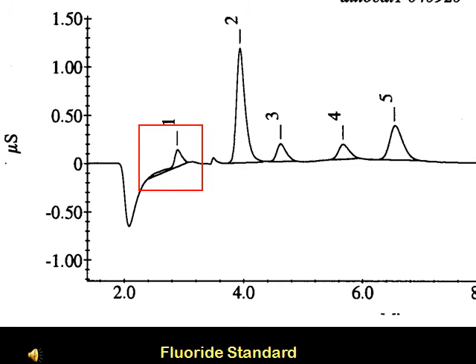ADHS does want to stress, however, that just because standard responses are consistent does not mean that they are scientifically valid and defensible. In this example, the laboratory's ion chromatography analysis of fluoride by EPA method 300 had the computer integrating part of the back edge of the water dip for all standards. All of the standards were consistently integrated this way. However, this is inappropriate and adds an inconsistent bias to the peaks as the standard concentrations vary.